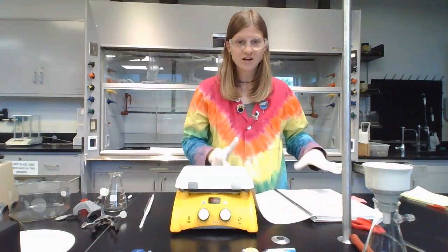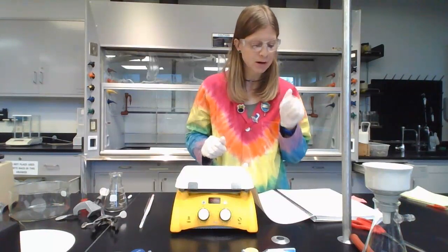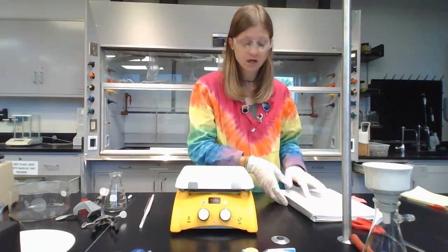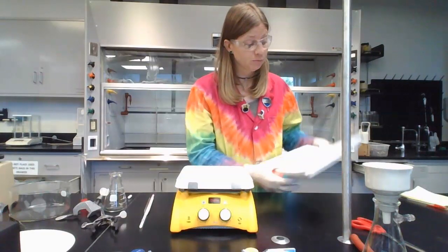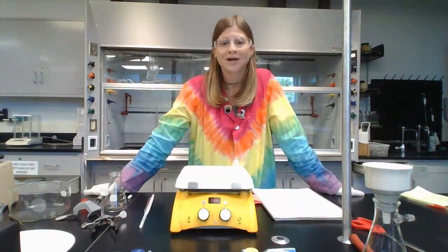This is the lab lecture for the procedure portion of the lab in Gen Chem 2, the preparation and analysis of aspirin. So we're making aspirin. We're trying to make aspirin anyway. And this is your glimpse into organic chemistry lab.